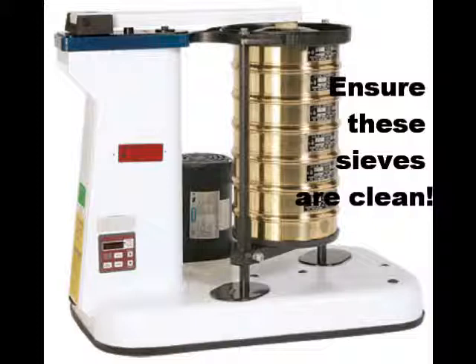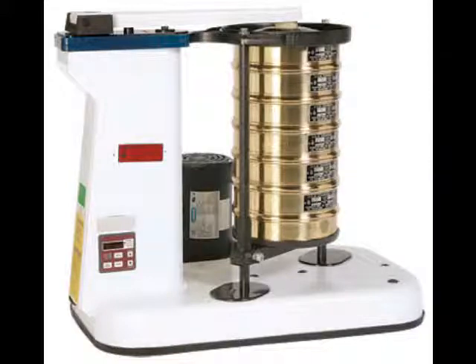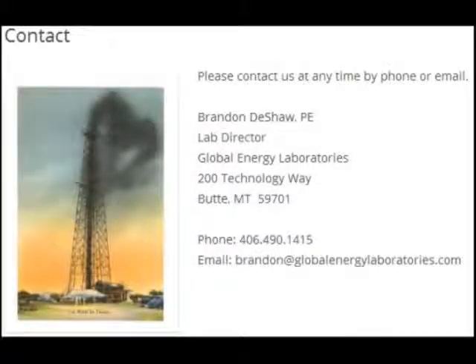You want to make sure that they are weighing the sieves carefully using calibrated scales. Just good old-fashioned laboratory practices.